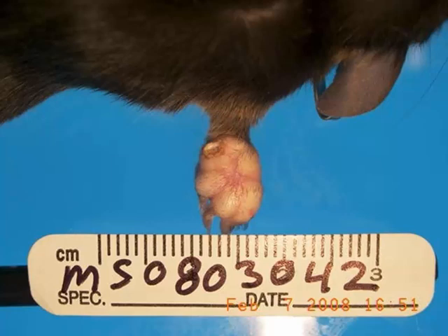Histologically, it's a very simple diagnosis to make. A nice Gram stain will usually illustrate the gram-positive nature and the coccal shape of the bacteria, but most people don't really even bother with special stains in this particular entity.